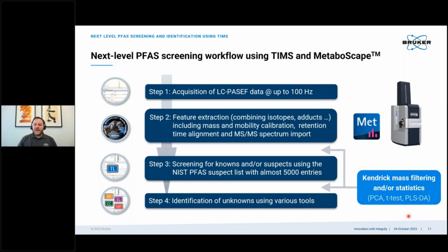Our Kendrick mass filtering and statistics can be done at any step in this process to help us identify which individual features, whether they're known or unknown, are most important to our analyses. What is contributing to the differences between samples, or for example, which ones are the most intense in one versus another.